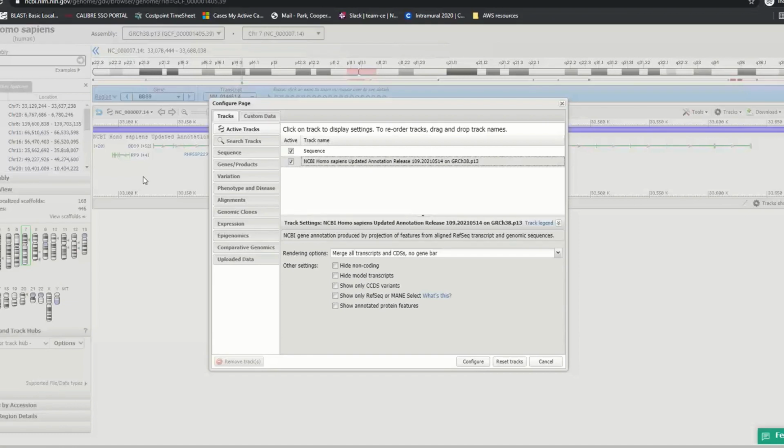And then on top of that, I'll also try and use NCBI's dbVAR data to help determine whether any variation I do find has already been cataloged in NCBI, so that I can hopefully get some more information about it.